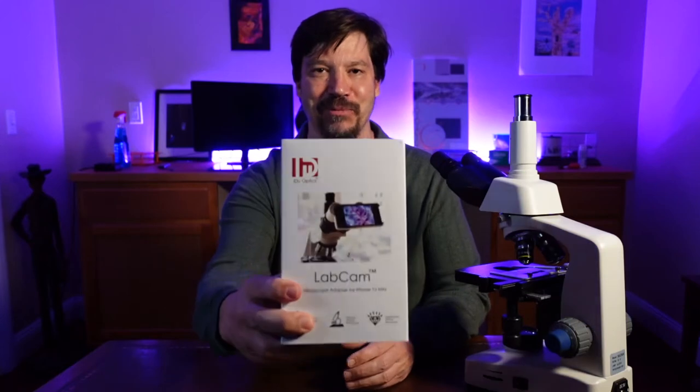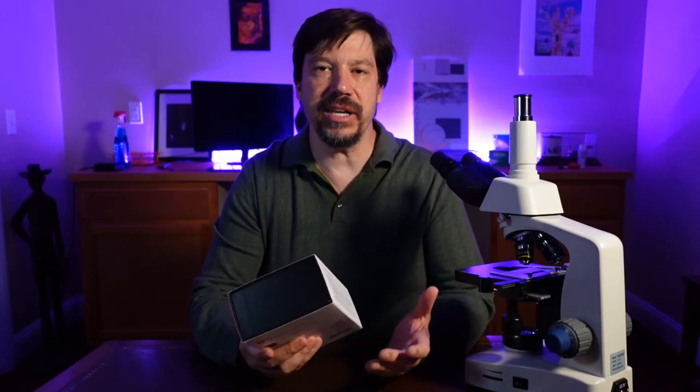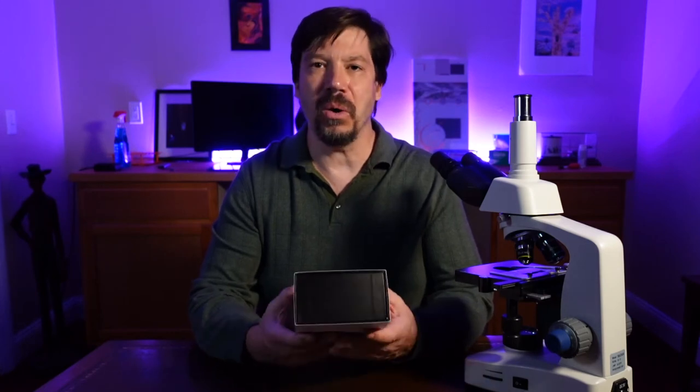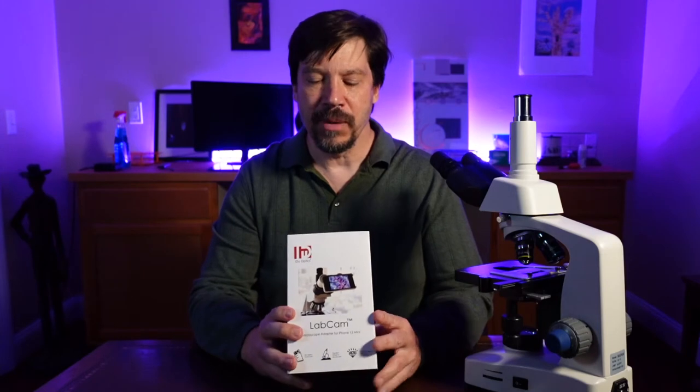Hello and welcome to Zoom In. I'm very excited today — we are going to be looking at the LabCam from iDo Optics. This is a device that allows you to take images and video with your iPhone. Now this is not just a simple phone holder as other things are. This actually comes with a lens. It's called LabCam but it's not really a camera — the actual camera will be your iPhone. But this has a lens that allows us to produce really nice images.